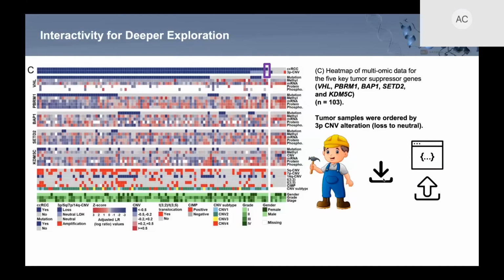For the coding one, you'd have to know how to code, and so that already limits who has access. In the second case, there's always a fear when transferring data from one store to another of some sort of untraceable transition between the two of them as it moves along. And there is also just the issue of wasting time and space with respect to time to upload, download data, and the redundant storage space.